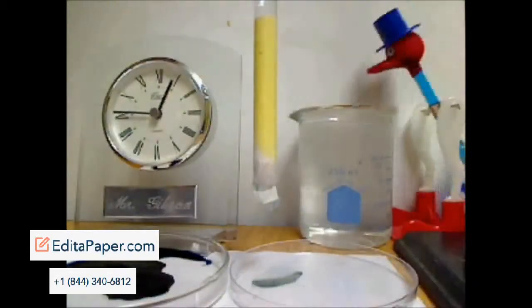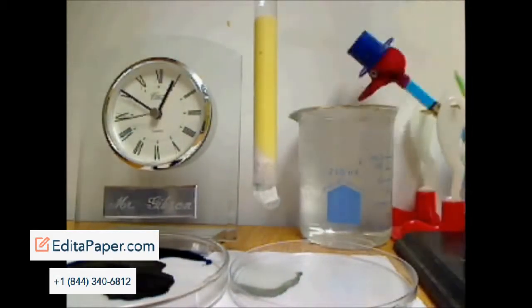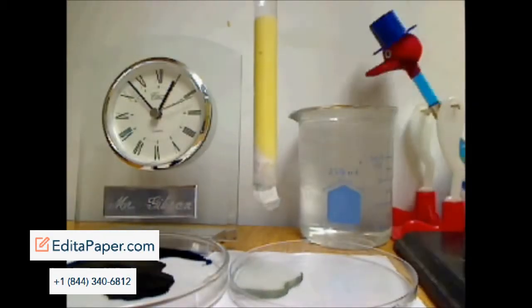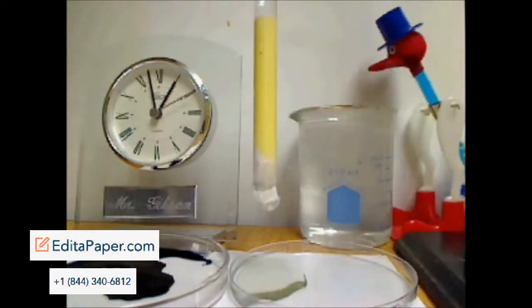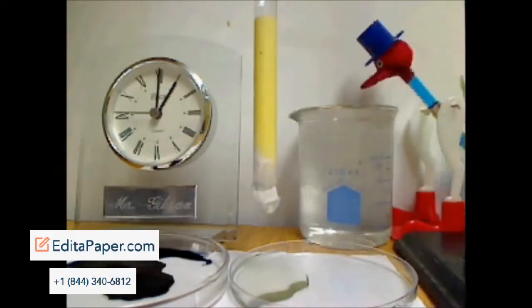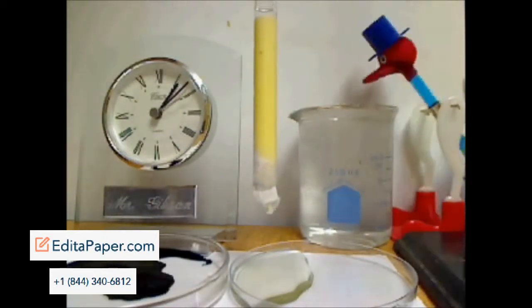And now I hope to collect the yellow sample. Now you can see the yellow's not really following through with the mobile phase. There's a little coming out, but not as much as I would have liked. So what you can do with column chromatography is change the mobile phase, and then it will hopefully flush it out. So I'm now going to change the mobile phase to acetone.